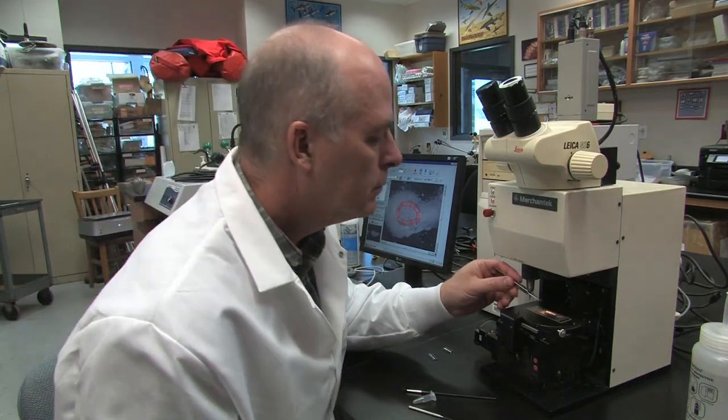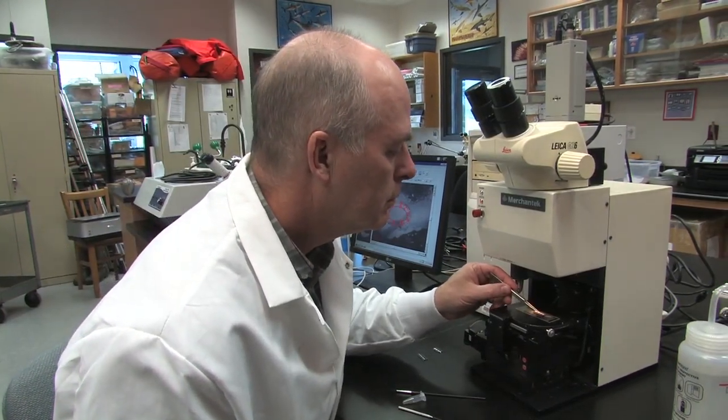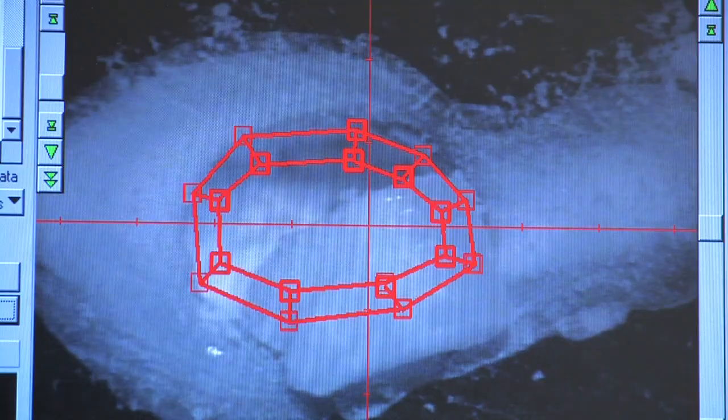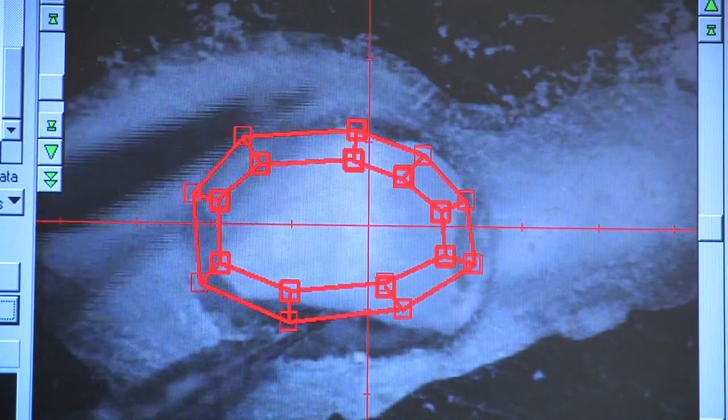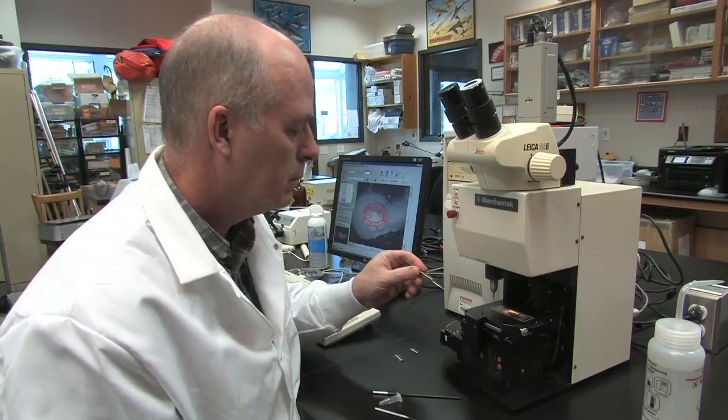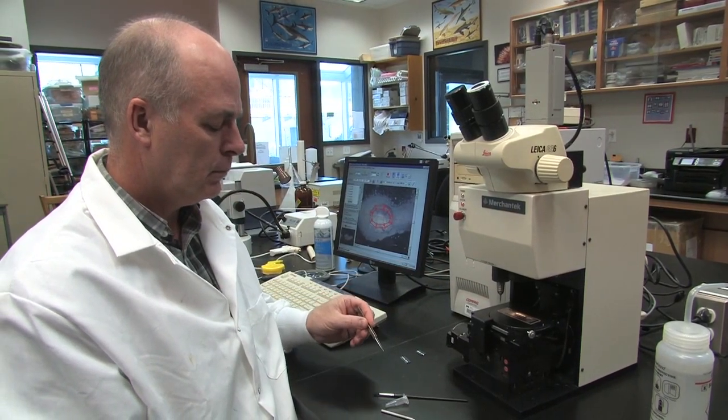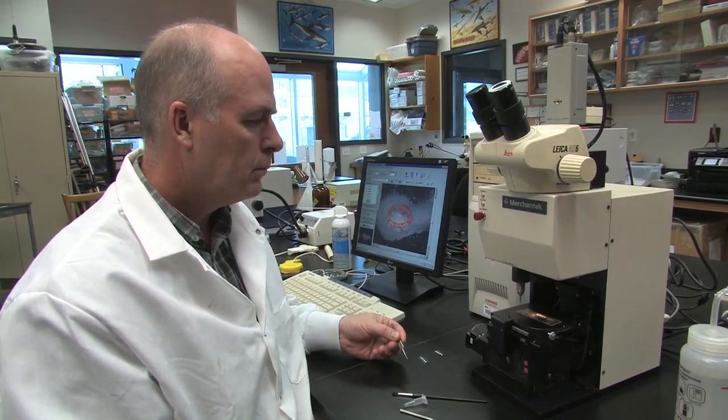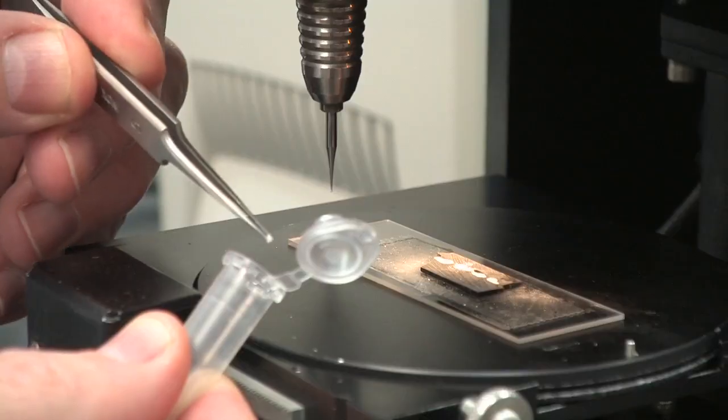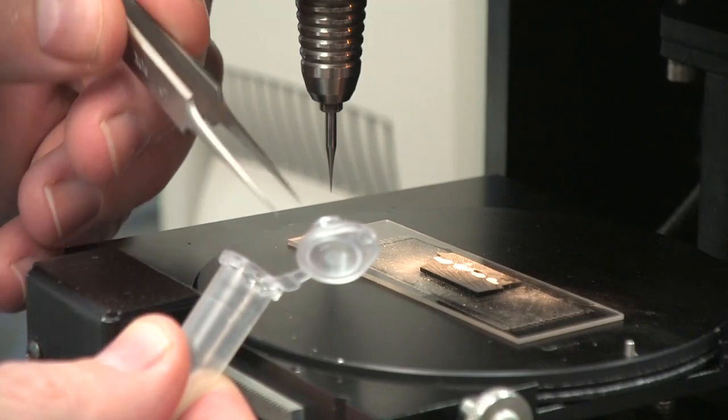Use either the naked eye or the scope to gently free the core pieces with a small pair of forceps. The piece or pieces of the core may be held in place by tape. Carefully remove the core pieces from the otolith and check for any residual tape or resin epoxy under the dissecting scope and place in a sample vial and weigh. The core samples can now be decontaminated and sent off for analysis.